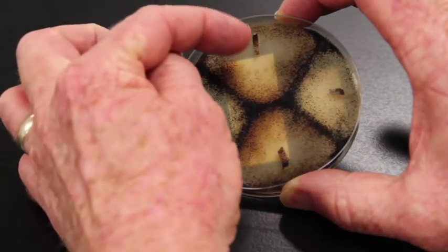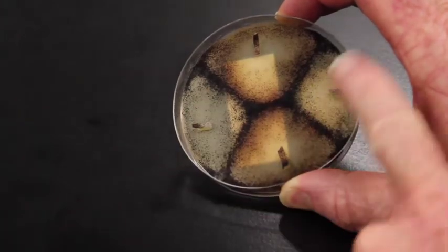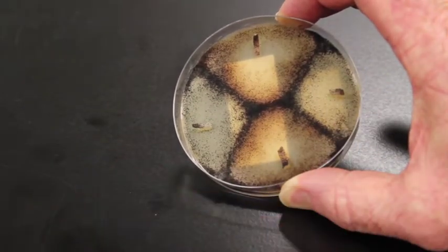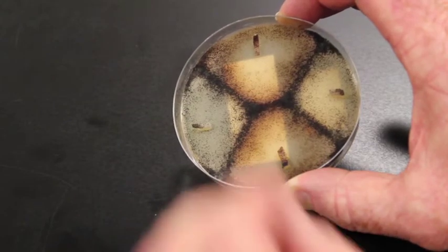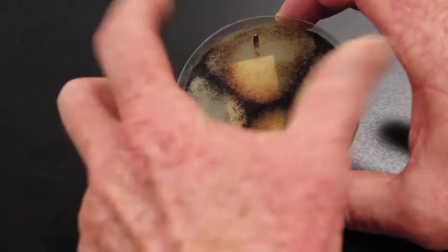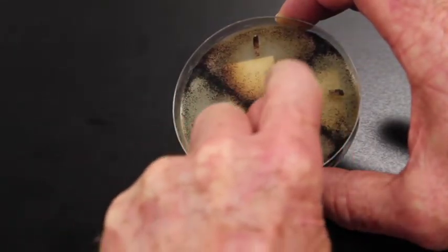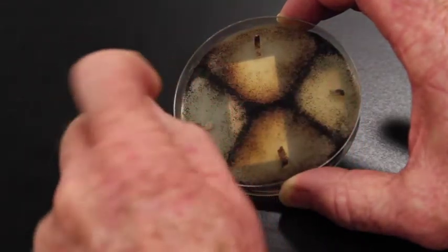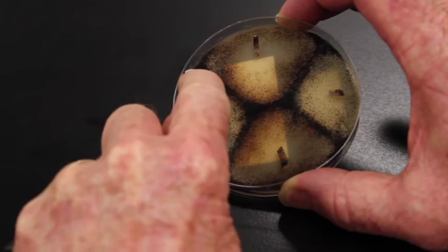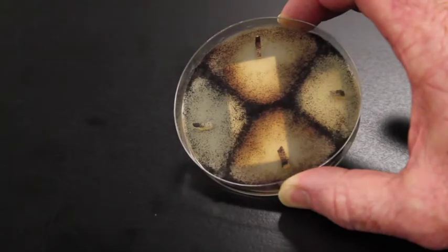So I put a tan strain here and a tan strain here, a wild type strain here and a wild type strain here. Then we have little filamentous structures called hyphae. Those hyphae have grown out from our initial inoculation point. And you can see right here in the connections between these different strains, we have sexual reproduction. All of these teeny tiny dots are basically the products of sexual reproduction in this fungus.